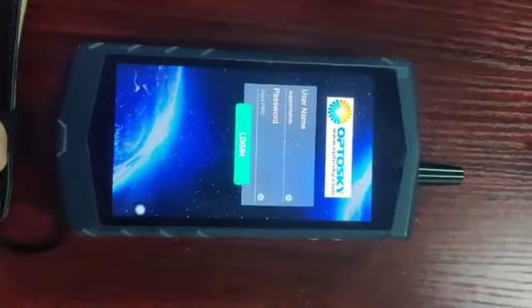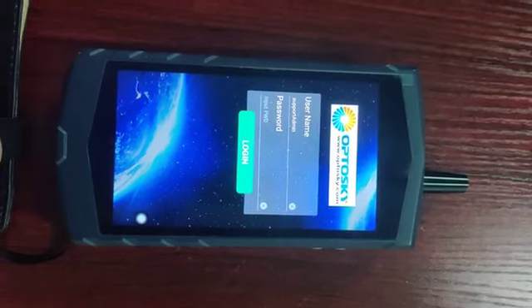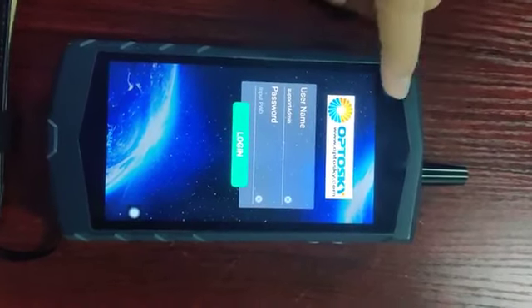Okay, hi. We would like to introduce how to calibrate the wavelength.